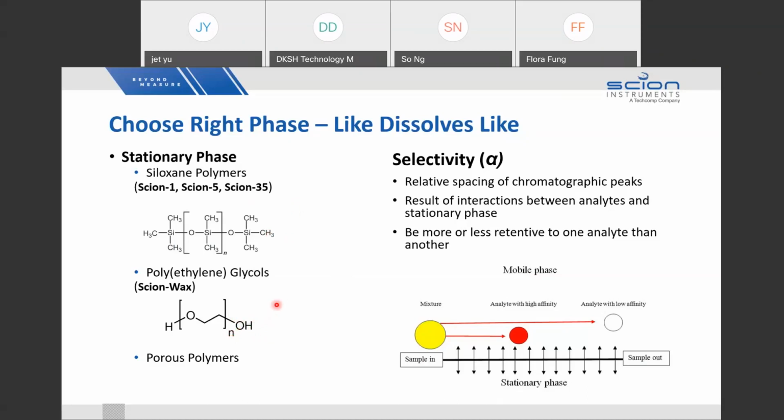So when you come with another compound like OH, there is hydrogen bonding in between. Hydrogen bonding is a very, very strong interaction force, a chemical force in between. Just like water. Why does water stay as water? Because there is hydrogen bonding in between. The water molecule is H2O, so the O interacts with the H from another molecule, and that H interacts with the oxygen of another water molecule. OH is a very strong bonding, hydrogen bonding in between.